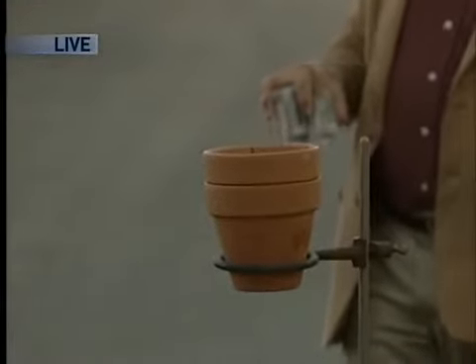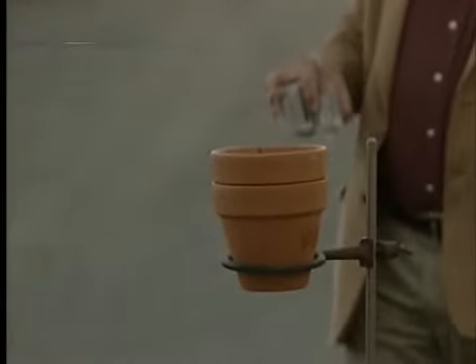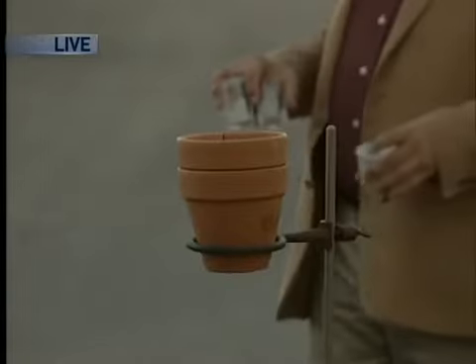This is what always gets me, the anticipation, waiting for it to happen. Because I feel like, oh, it's not going to happen, I'll go check it out. See, now the problem with a thing like this is, it's kind of like a dud with a firecracker.